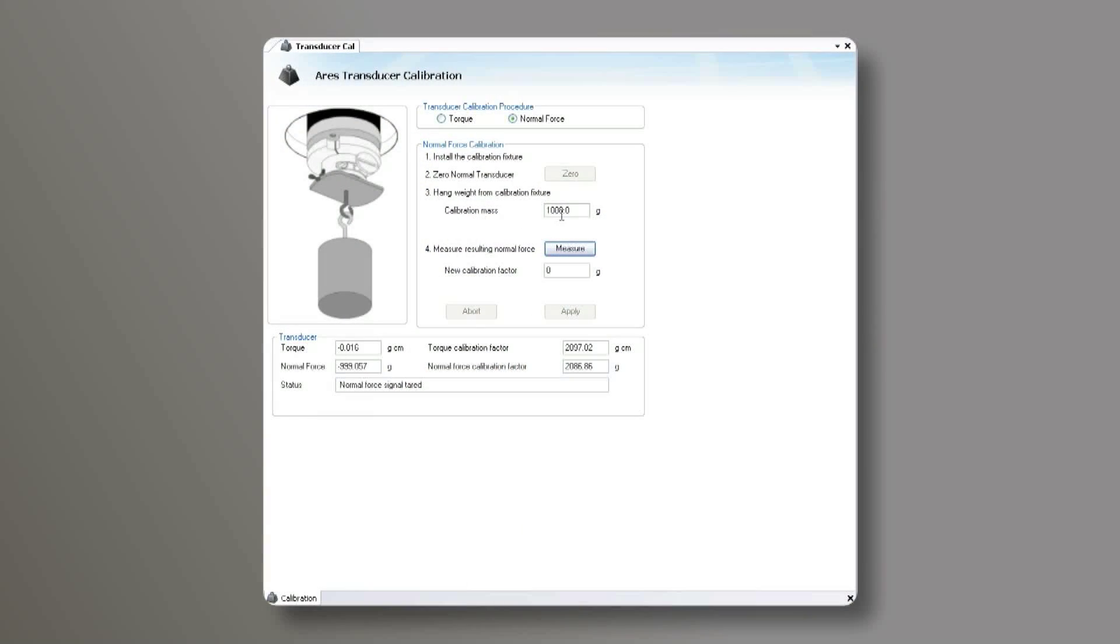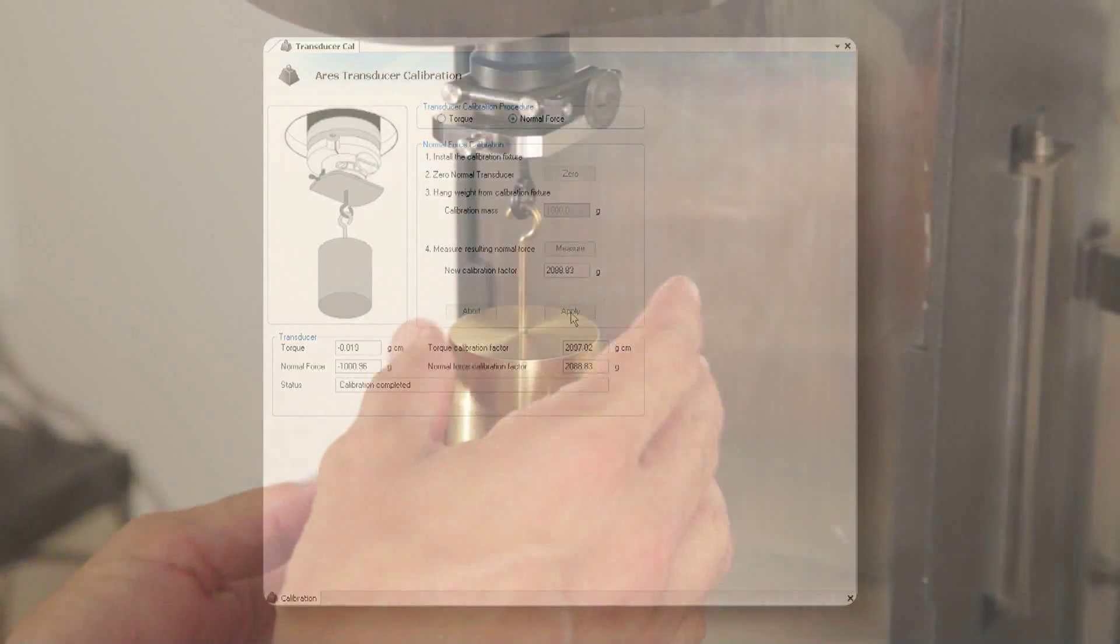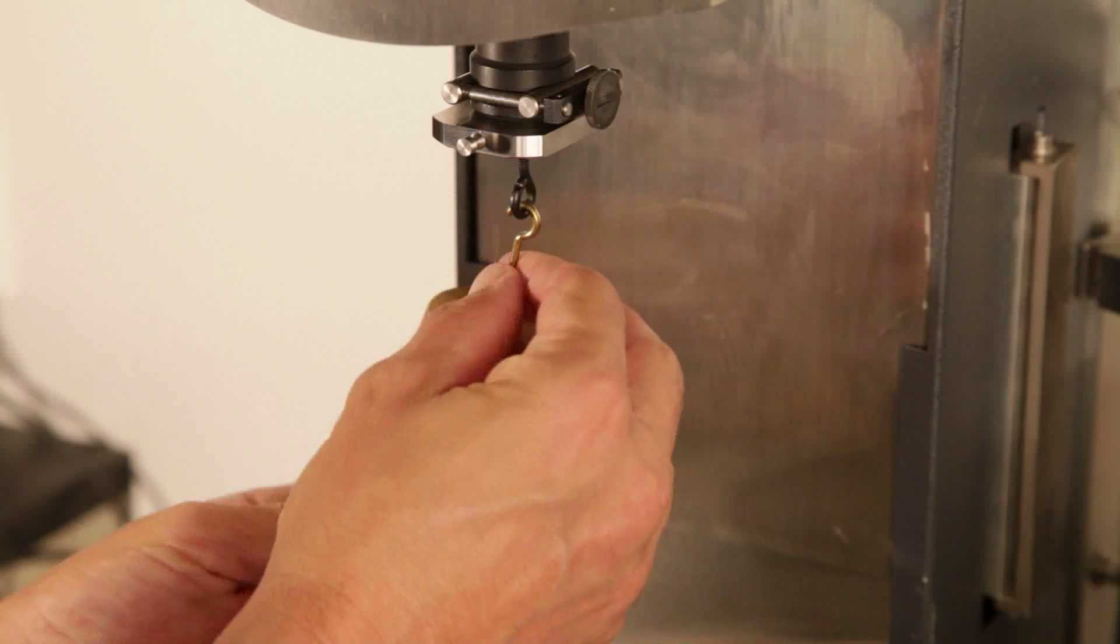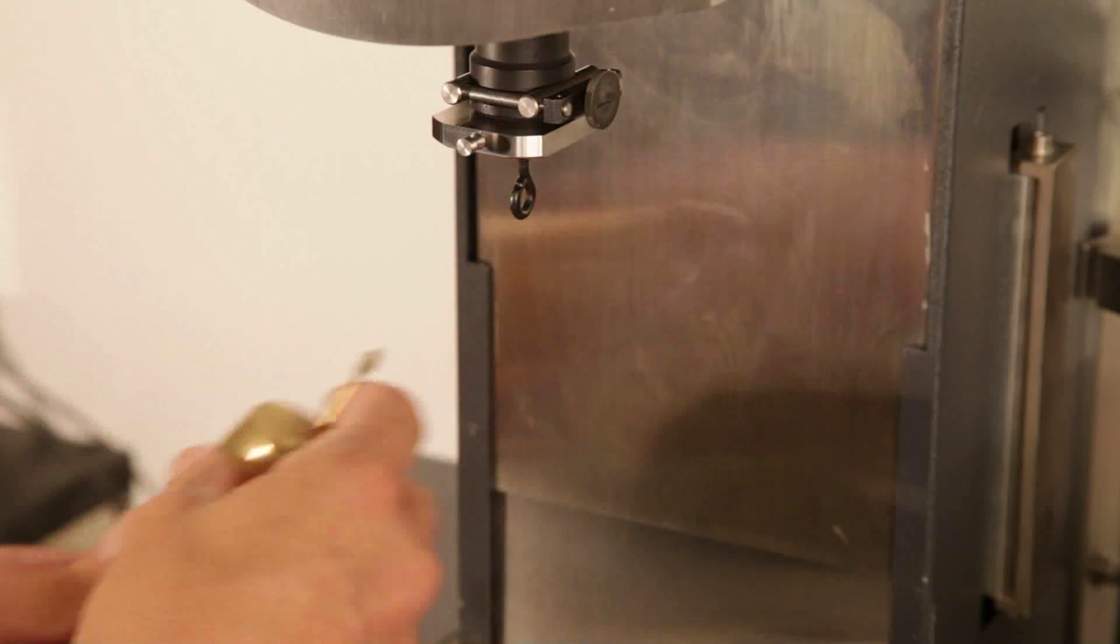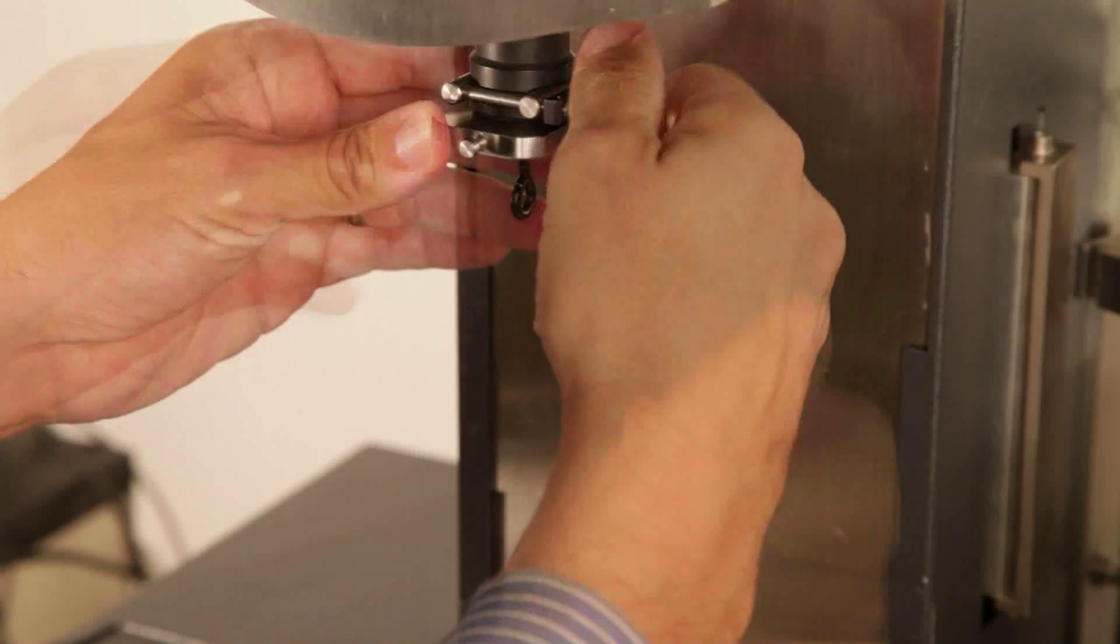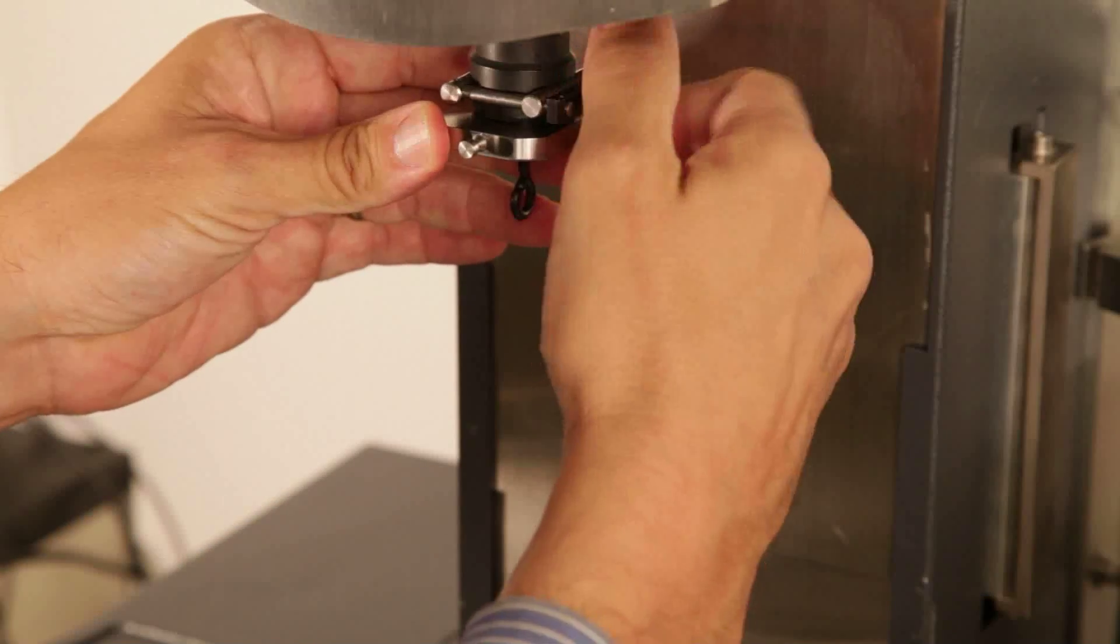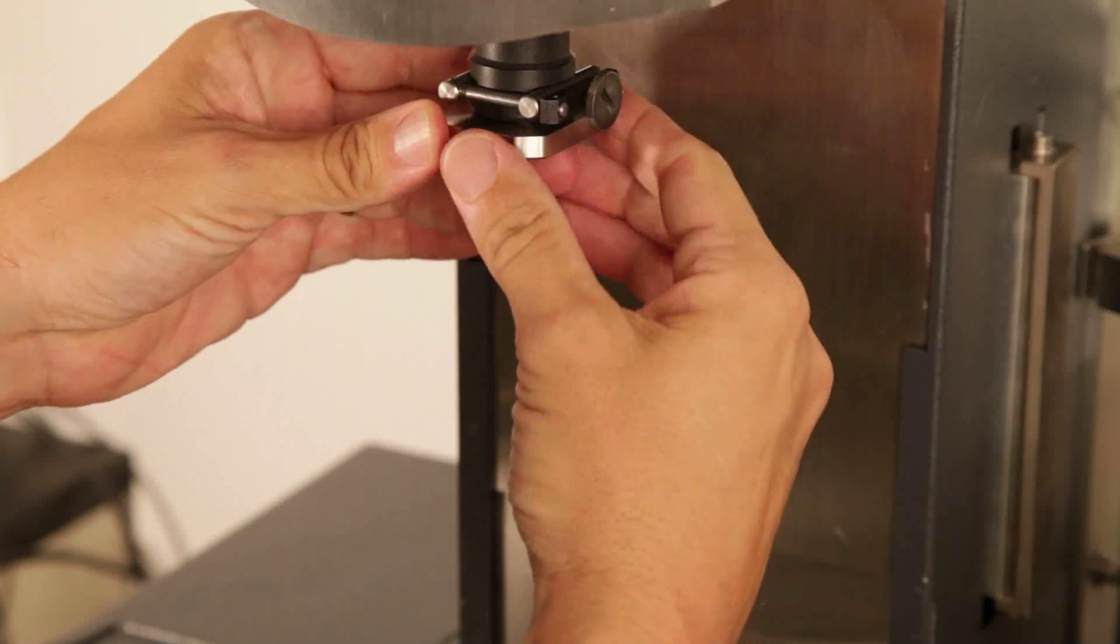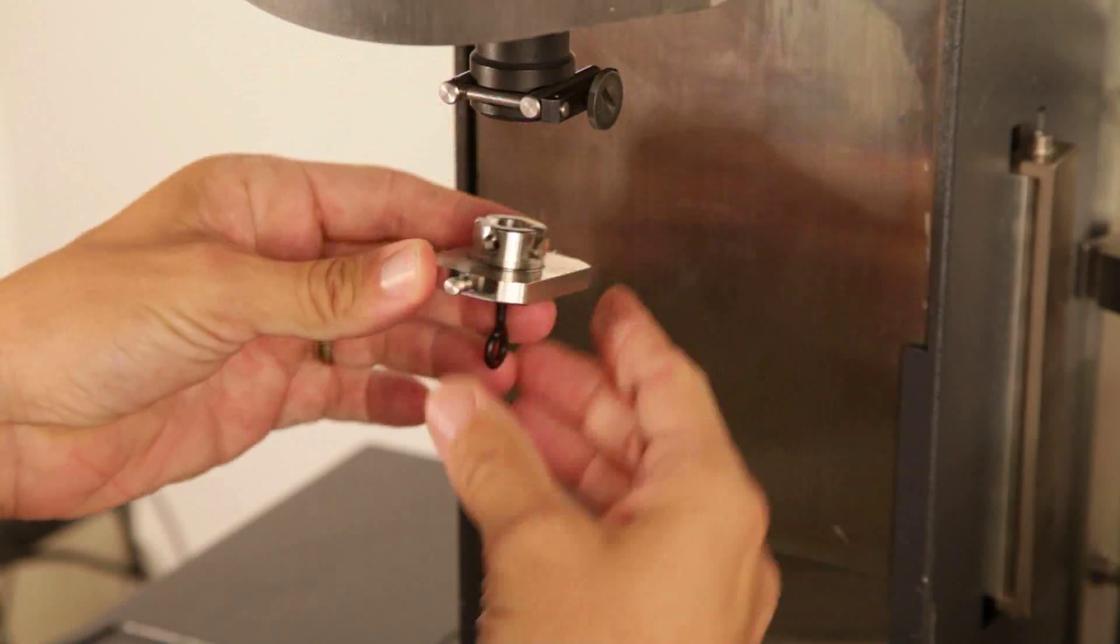After the measurement is complete, apply the new calibration factors. Lastly, remove the weight and the calibration fixture. You have completed the normal force calibration.